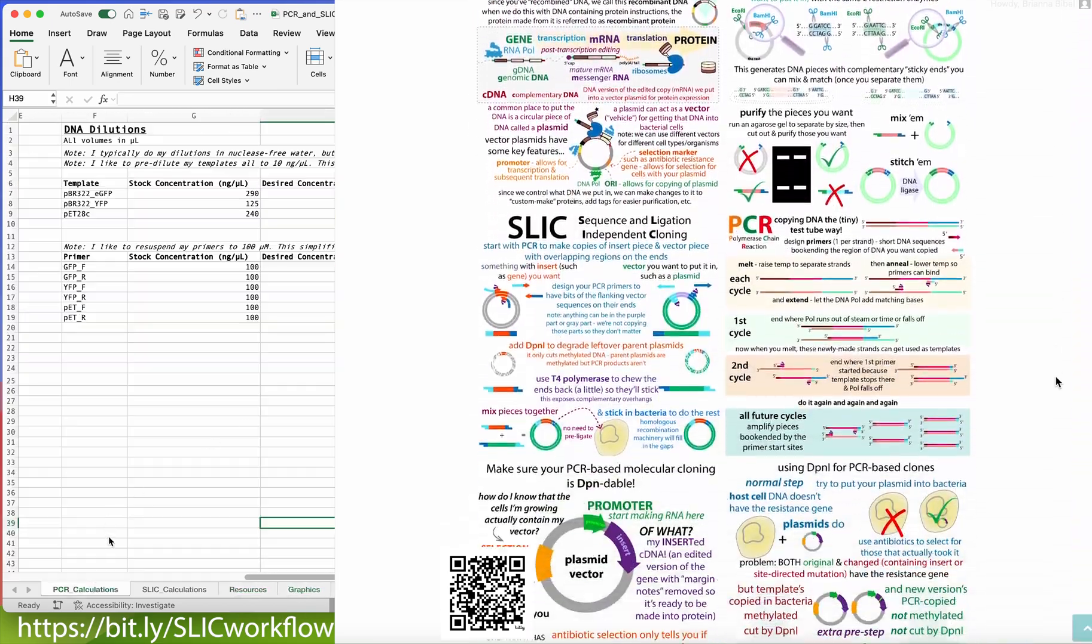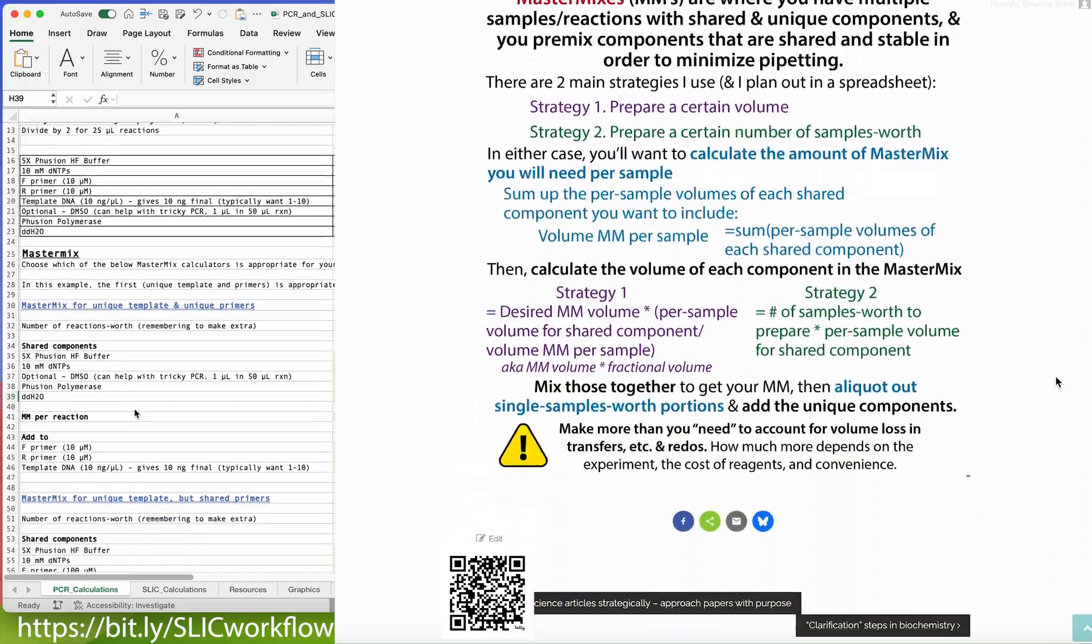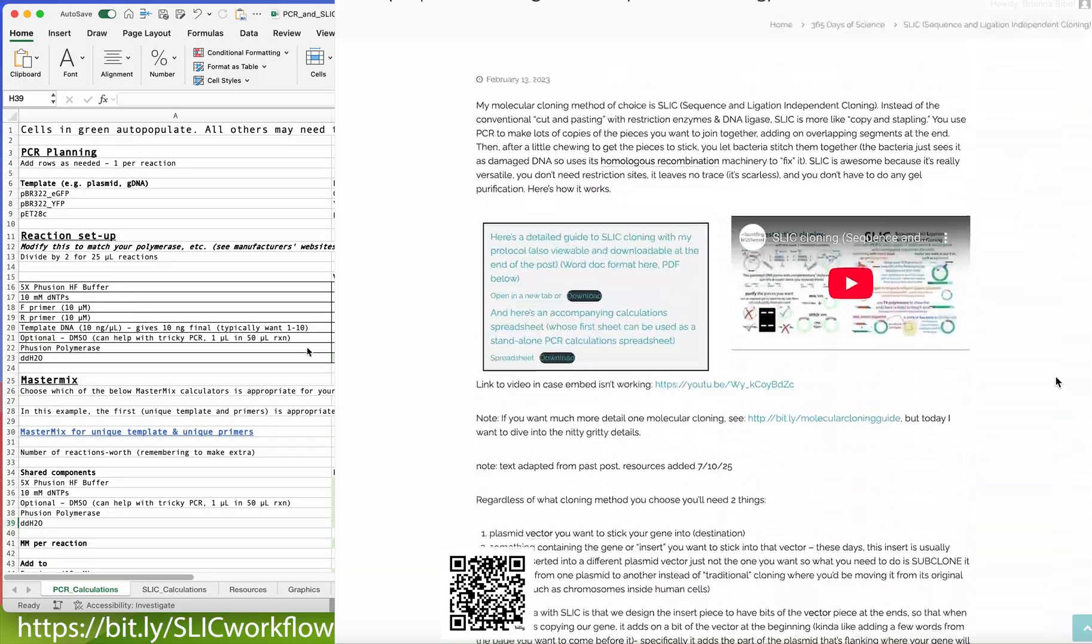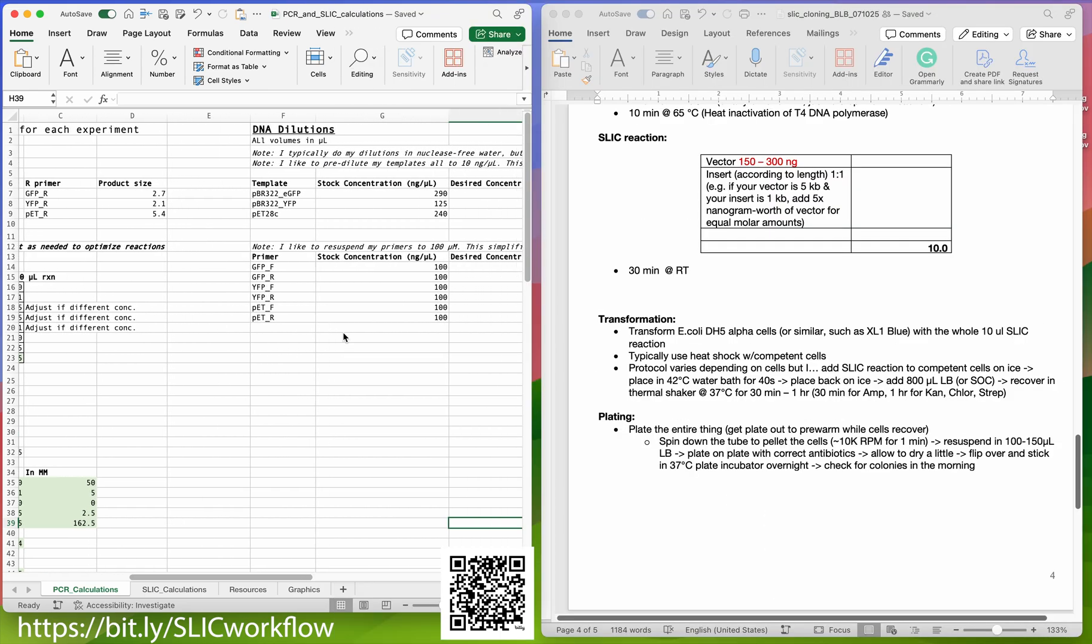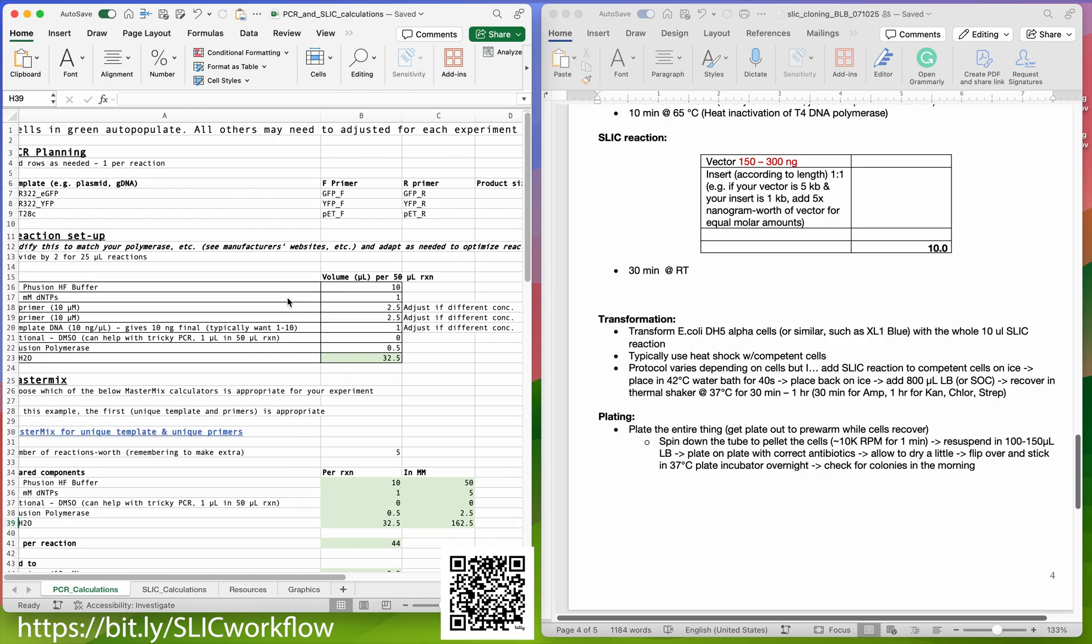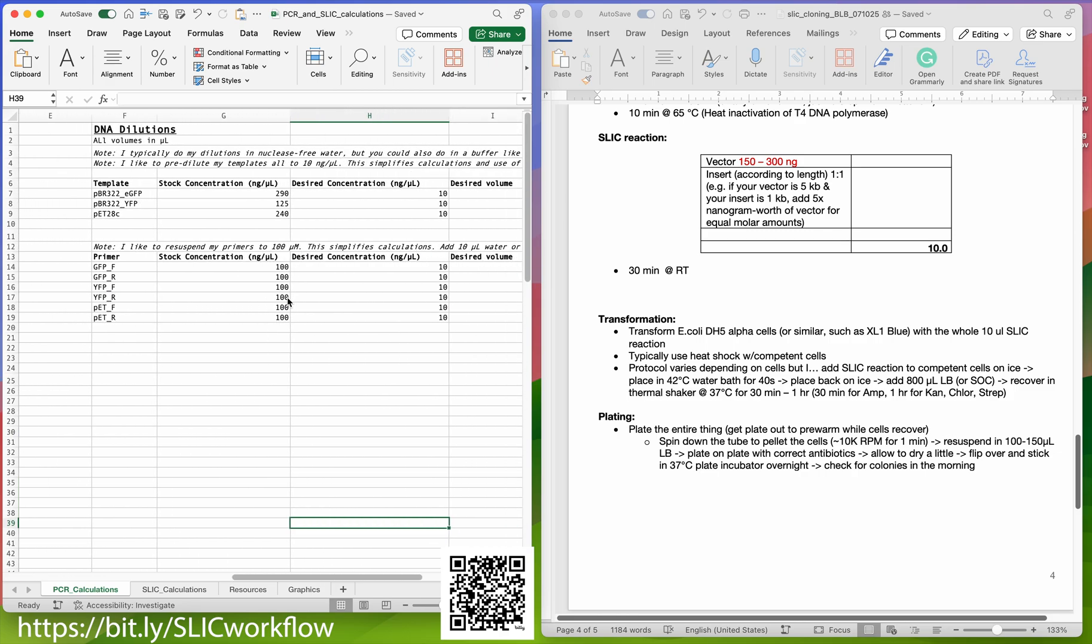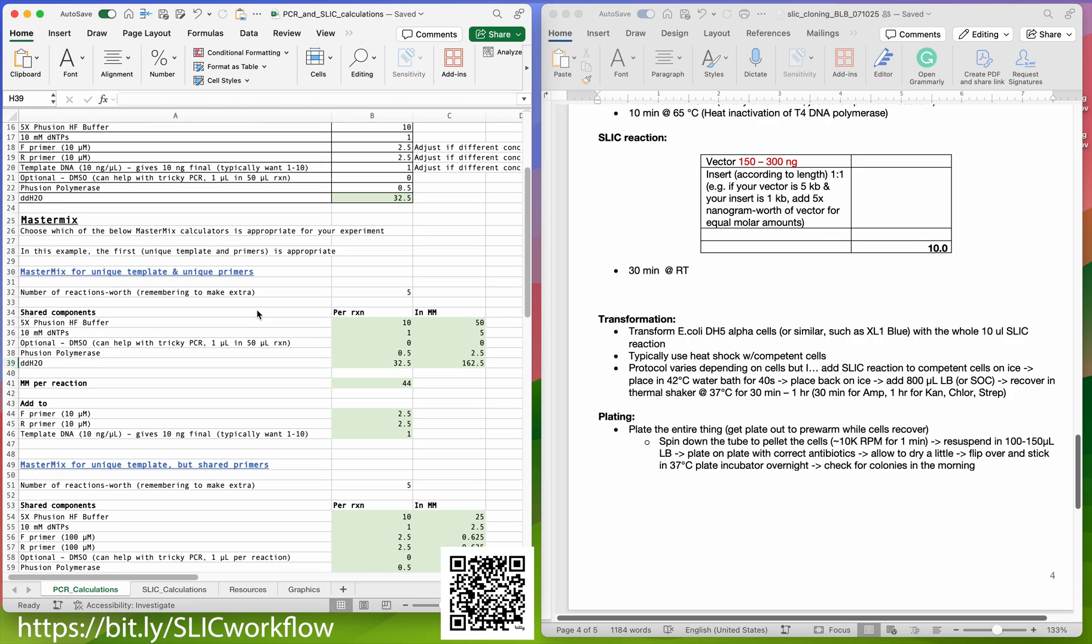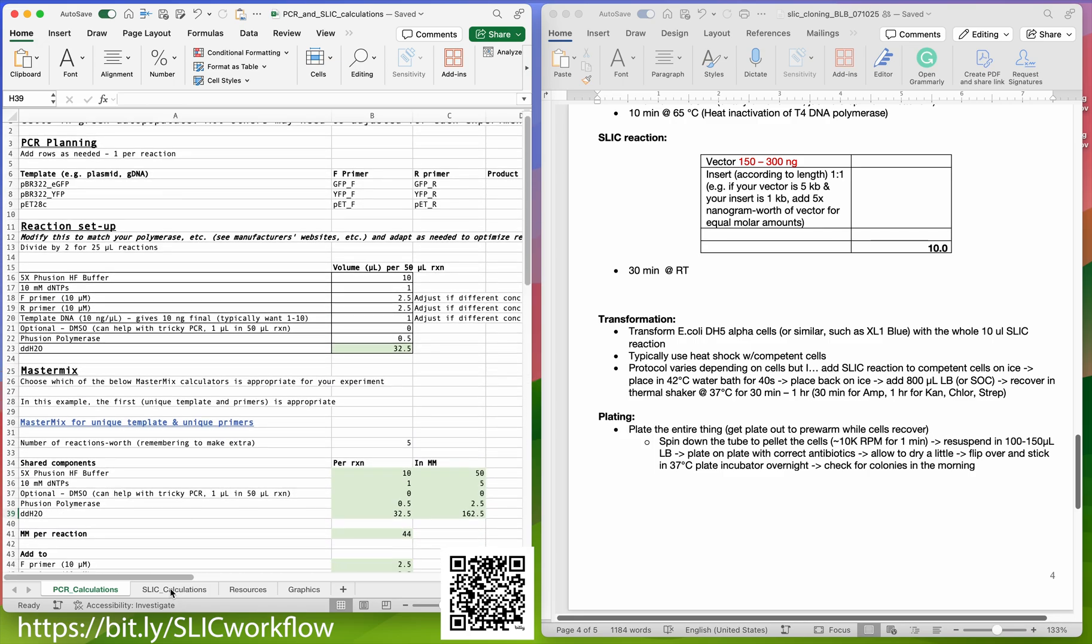Hope this helps you. Feel free to use and adapt these as you need, depending on what polymerase you're using and the concentrations of things. I also have some notes about dilutions that you can do. I like to pre-dilute things to the same concentration to make my life easier. The cells in green will auto-populate, and then the others you might need to adjust. Hope this helps, and happy cloning!